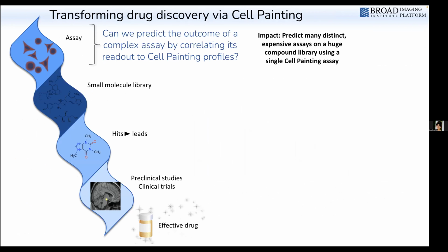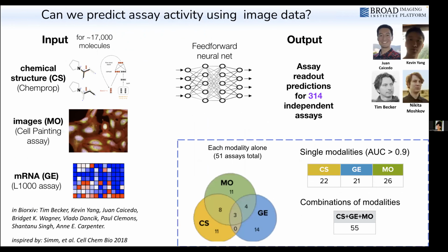And finally, in terms of applications, cell painting can be used to predict other assays. Large-scale assays for drug discovery can be expensive and impractical, particularly for model systems that require primary cells, organoids, or whole organisms. But as an alternative, an international team, including Janssen and many others, had demonstrated that data from a single high-throughput imaging assay can be repurposed to predict the biological activity of compounds in other assays, even those examining unrelated pathways or biological processes.